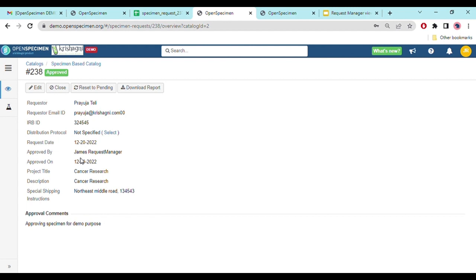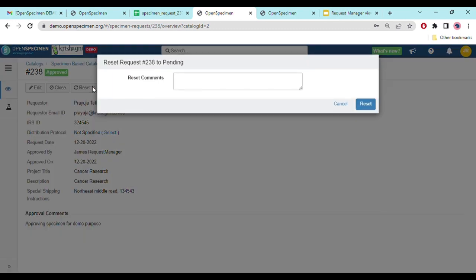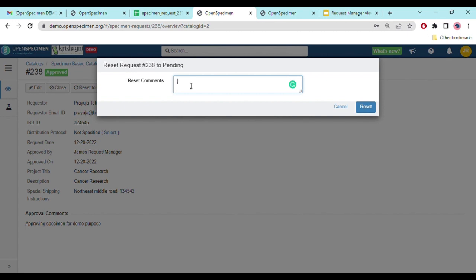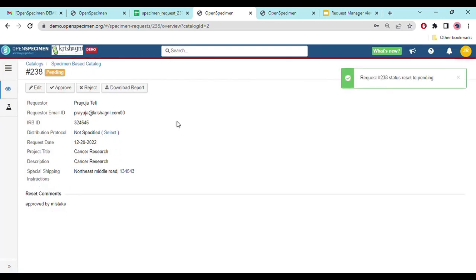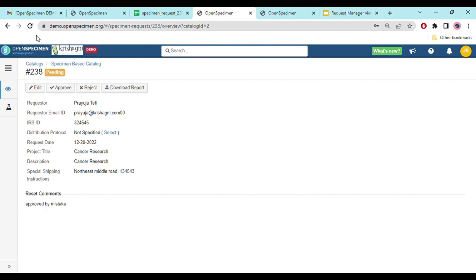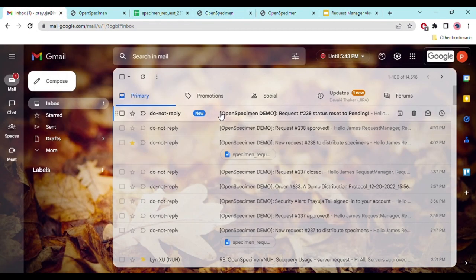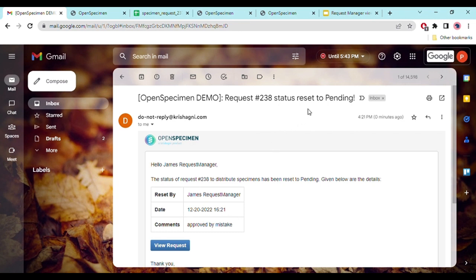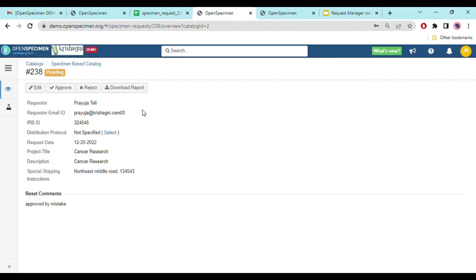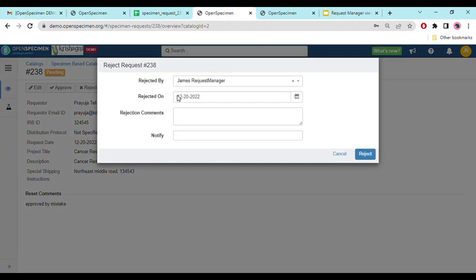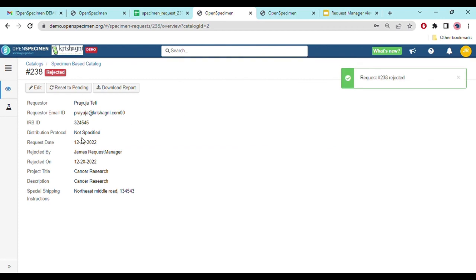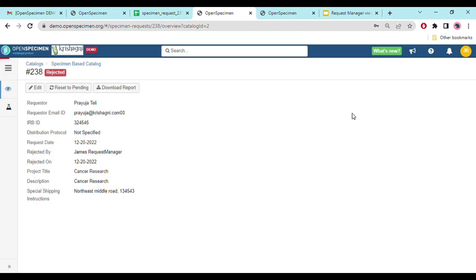If by human error you approved a request by mistake, you can reset it to pending using the 'Reset to Pending' option. Clicking it will ask you for a reason — for example, 'approved by mistake'. Once reset, the reset comment is updated on the request, and you'll also receive an email that request #238 status has changed back to pending. Similarly, for rejection you can add comments and notifiers, and if rejected by mistake you can also reset it to pending.